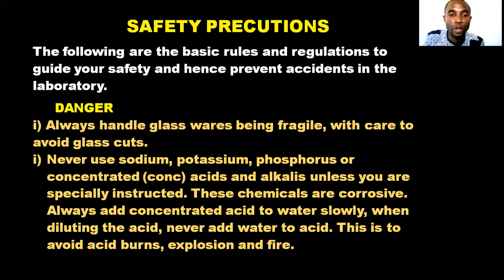You need to take some precautions, which are the safety precautions you need to follow. Why? Because there are dangers. Now, one is that always handle glass wares with care, because glass wares are fragile, to avoid glass cuts. When you are handling them, because most of them are glass wares, handle them with care.